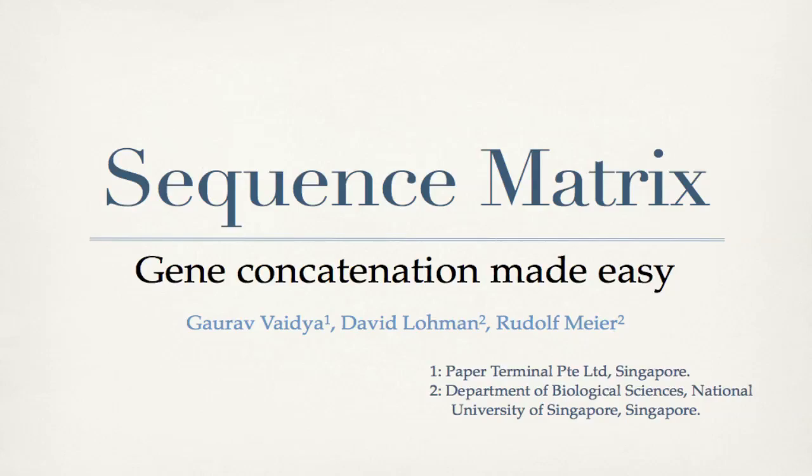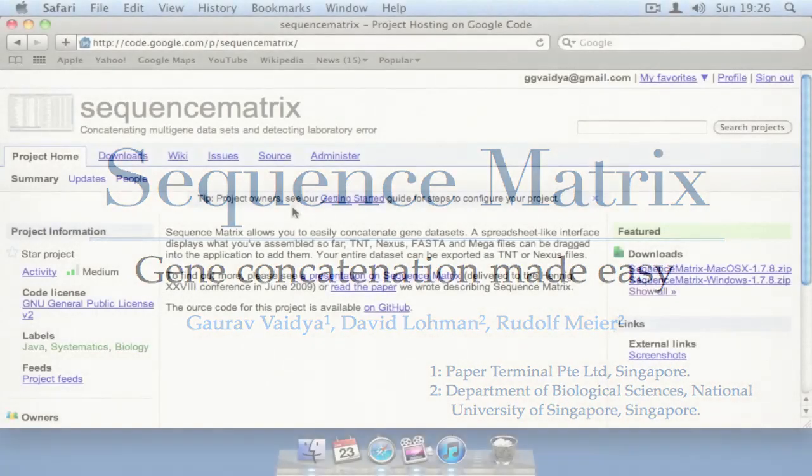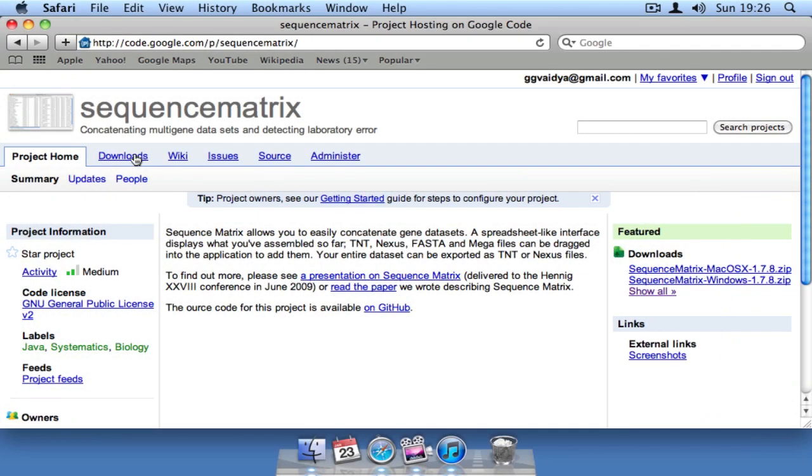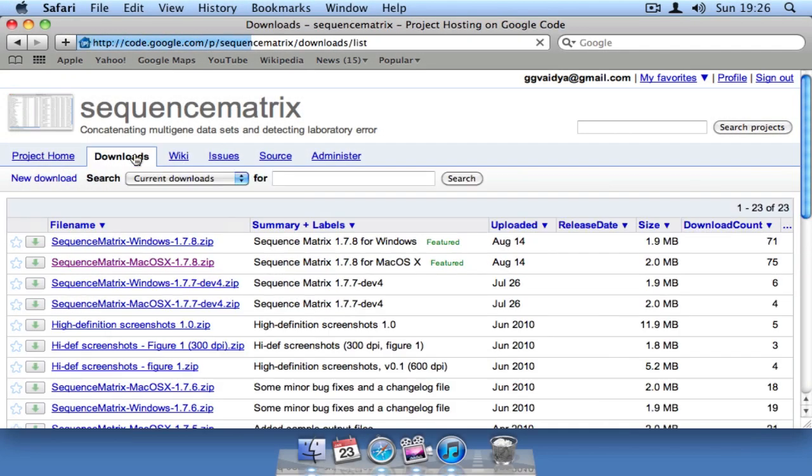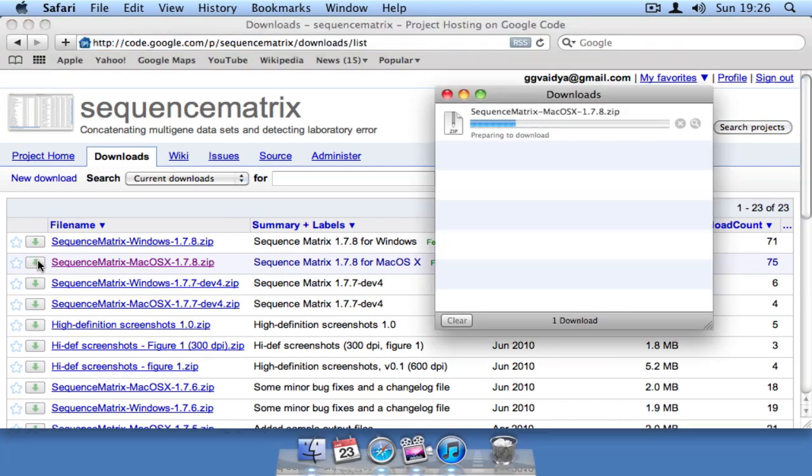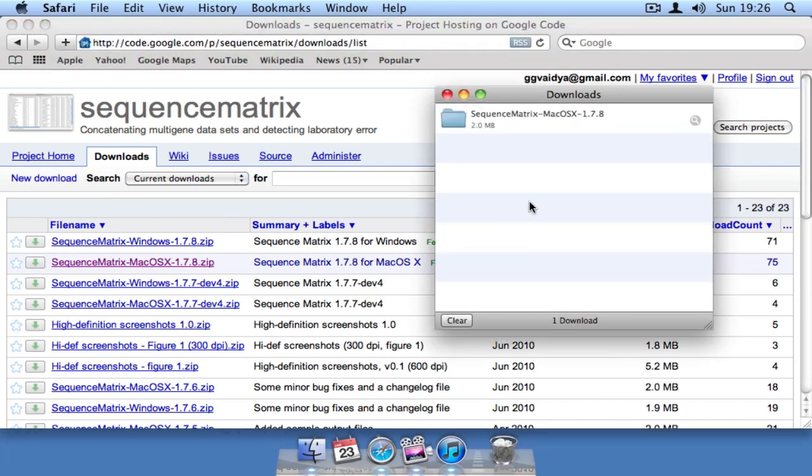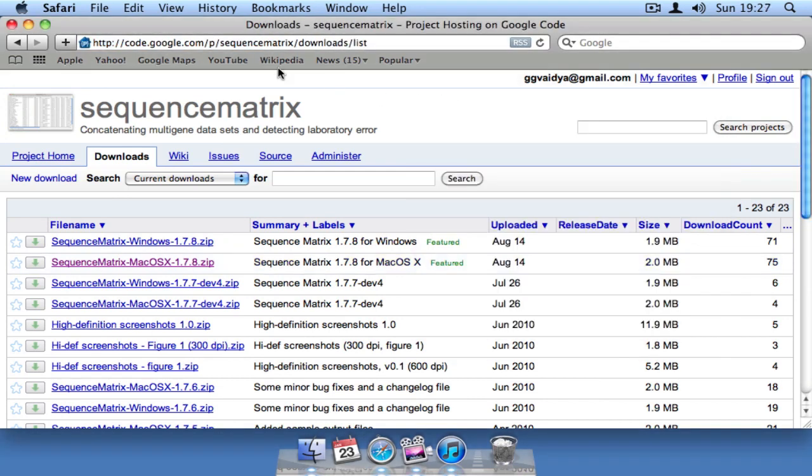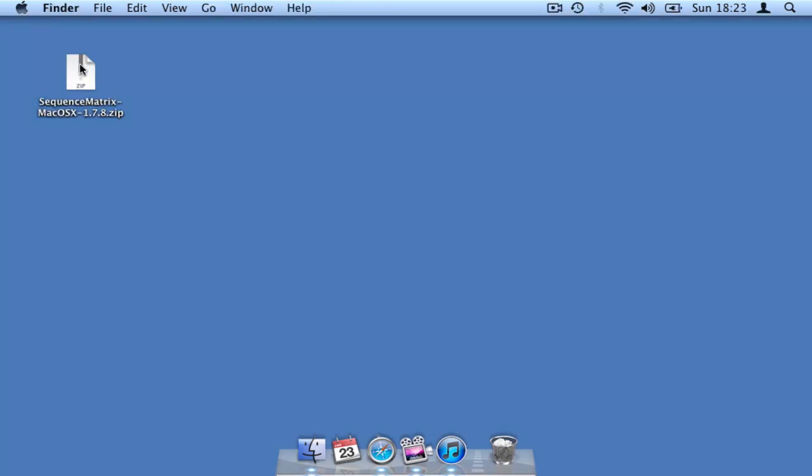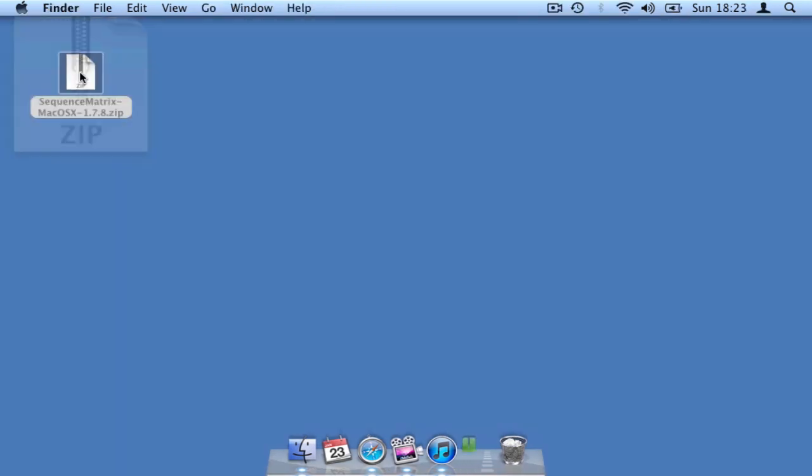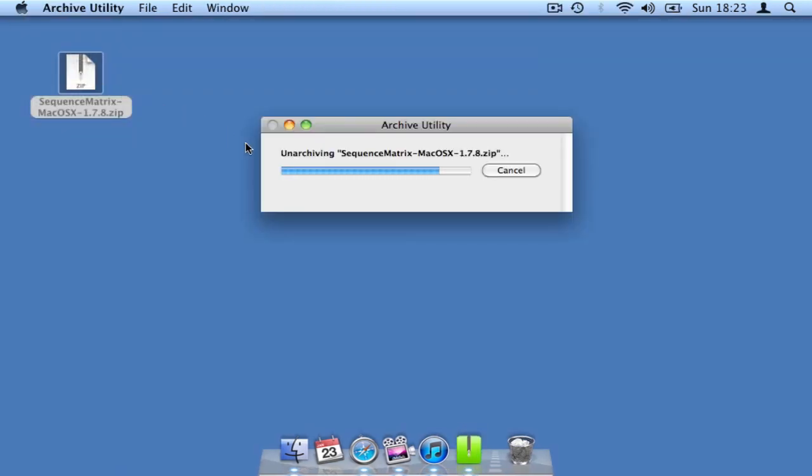This short video will introduce you to the features of Sequence Matrix, a Java-based software program for concatenating and formatting genetic data. This video will demonstrate the features of the program operating in an Apple Macintosh environment.